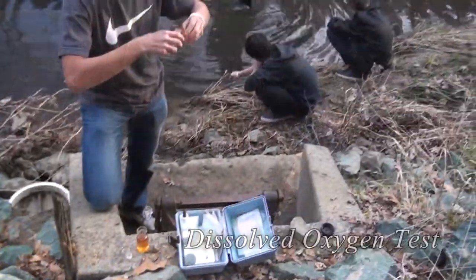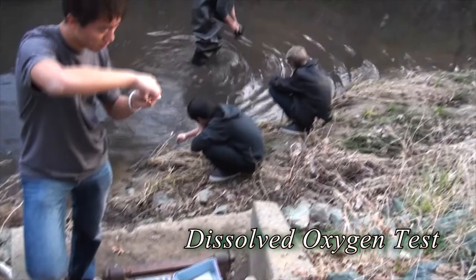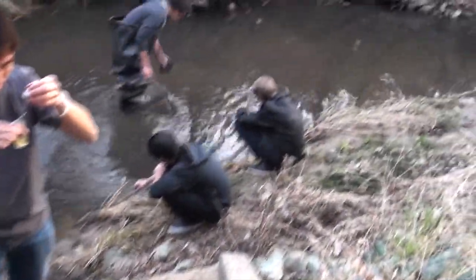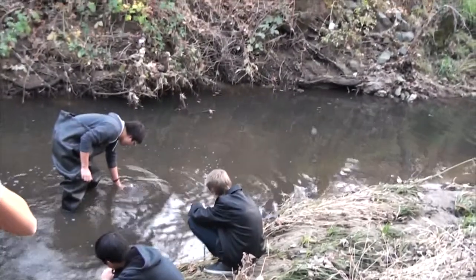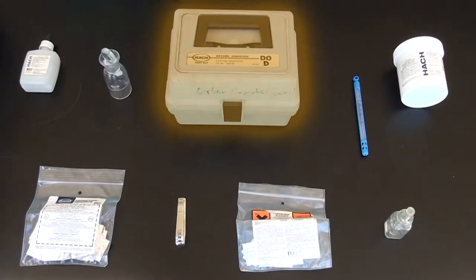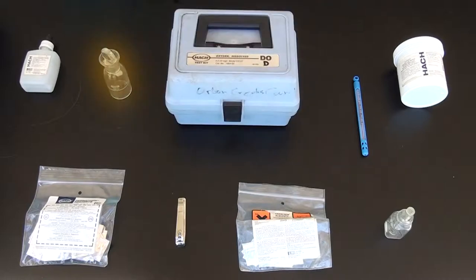The dissolved oxygen test is one of the primary tests that chemistry performs. The purpose of this test is to measure the creek's ability to support life by testing for atmospheric oxygen mixed in the water. To perform this test, you will require the DO kit. This kit should include a bottle and stopper, a square beaker and glass test tube, thermometer, and nail clippers, along with the following chemicals.